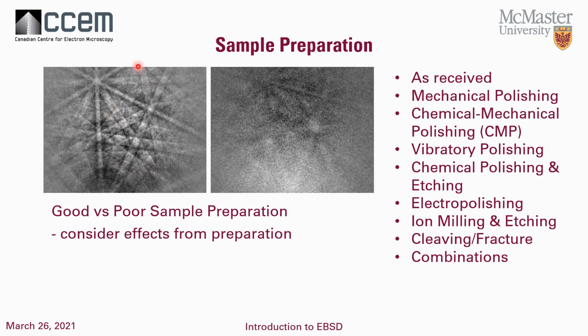But you want to be able to create a pattern that you can collect fast, that you're actually going to be able to see the bands, or that the computer will be able to see the bands so it can identify the crystal structure. You also have to consider when you're doing the preparation, has it caused any effects that have affected seeing the bands?